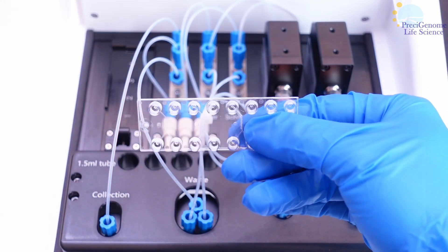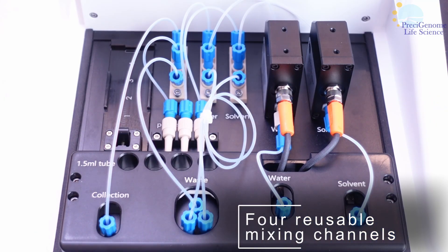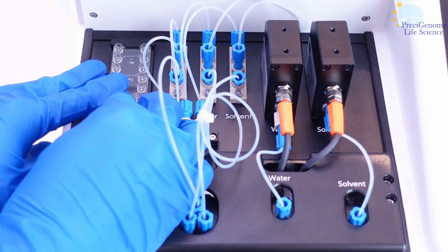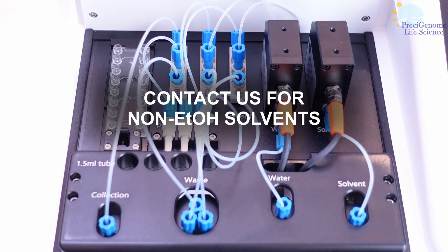The standard mixing chip is the Mix4, which has four Tesla mixer channels. Channels are reusable depending on formulation and suitable for polar organic solvents. A glass mixing chip is also available for harsher solvents or special requirements.